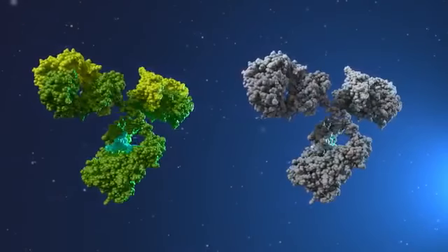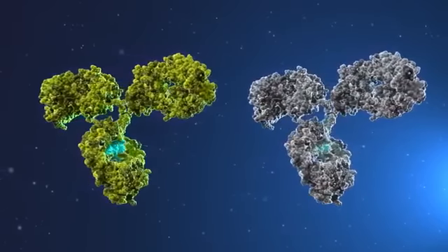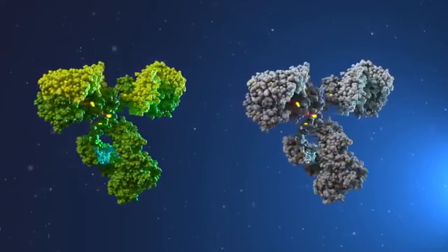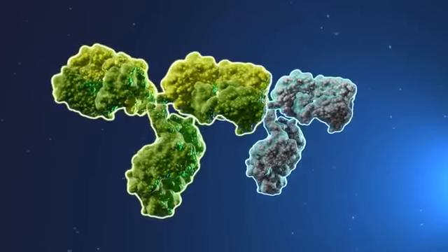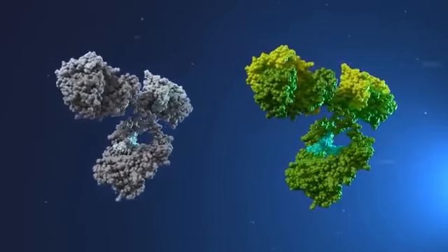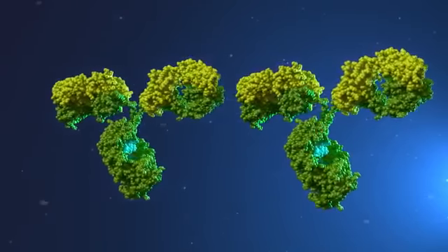Liquid chromatography with mass spectrometry is an essential tool for determining primary and higher-order structural similarity between an innovator and a biosimilar. The combination of protein level, peptide level, and higher-order structure studies empowers a biosimilar producer to systematically demonstrate comparability of key product attributes. Your ability to execute these studies will form the foundation for successful regulatory submissions that establish biosimilarity to an innovator molecule.